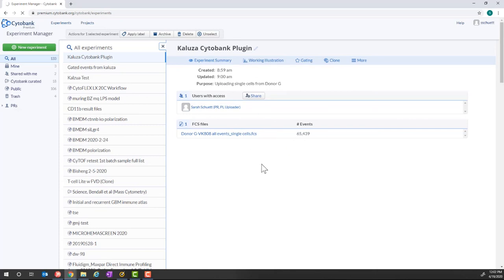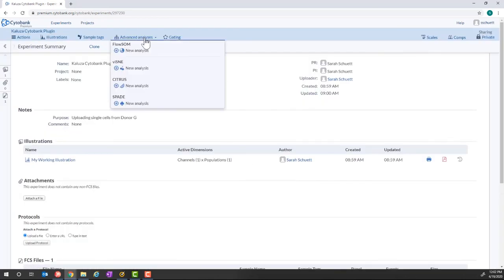From the experiment summary you can start running advanced analysis. The Clusa Cytobank plugin allows users to move compensated, transformed, and anonymized data sets from the Clusa desktop software to the Cytobank cloud platform. This allows users to take advantage of the intuitive compensation adjustments supported by Clusa and the machine learning algorithms integrated in the Cytobank platform. Combining both packages offers the user flexibility to choose from a broad offering of features and functionalities and to customize their analysis pipelines to fit their research needs.